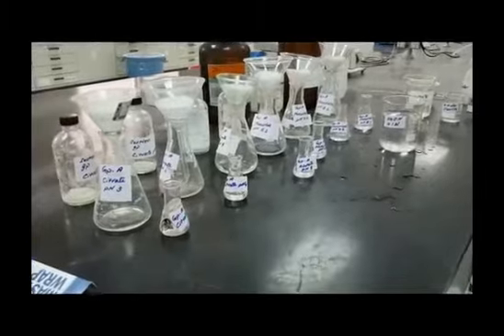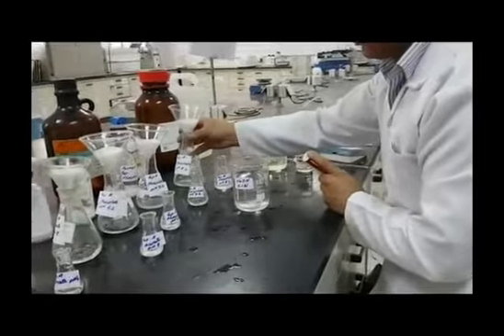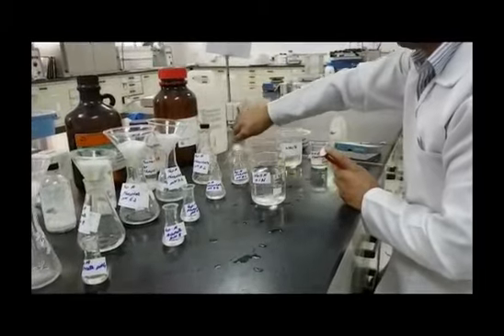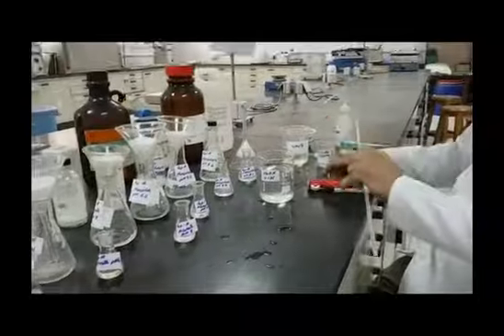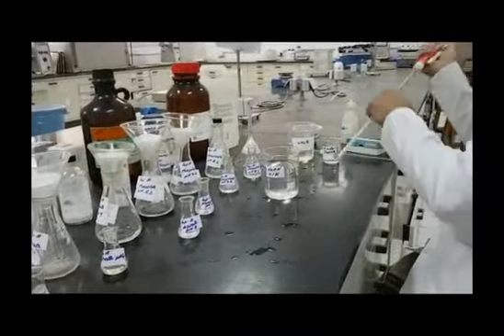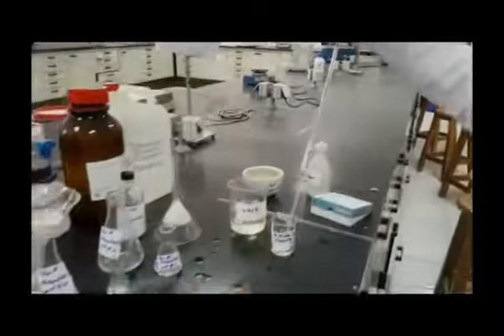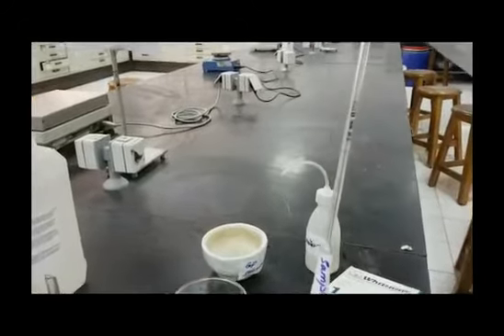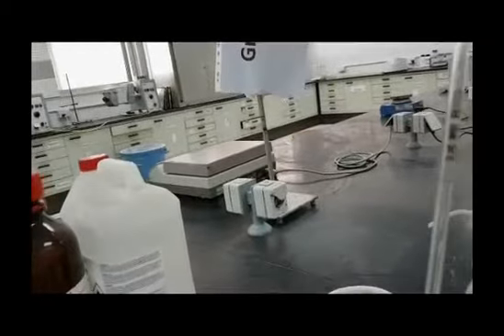After generating your filtrate, try to complete filtration up to the end. Withdraw, using a clean 10 ml volumetric pipette, 10 ml from each filtrate, and place it as labeled in the Erlenmeyer flask used for dilution.